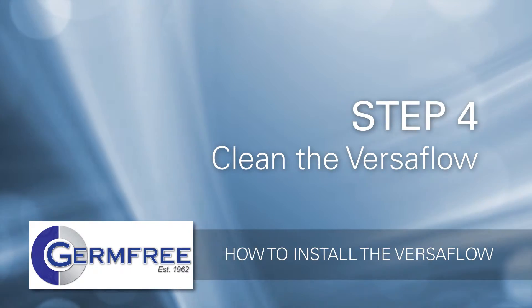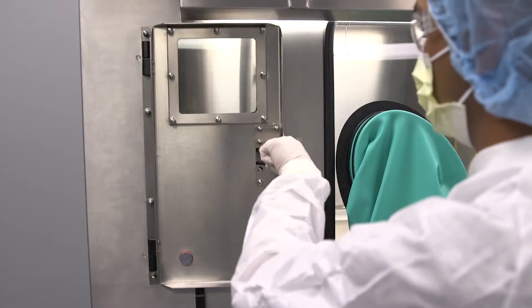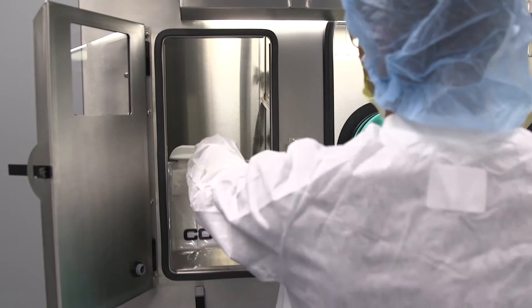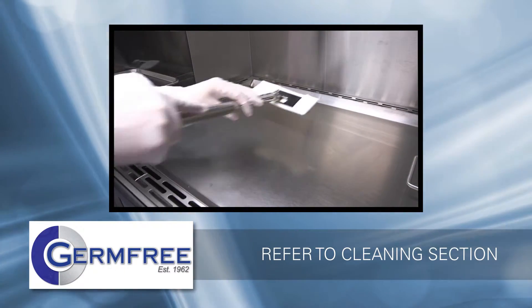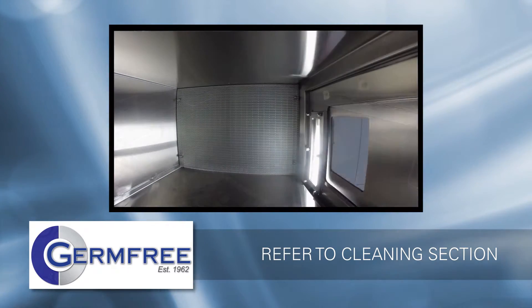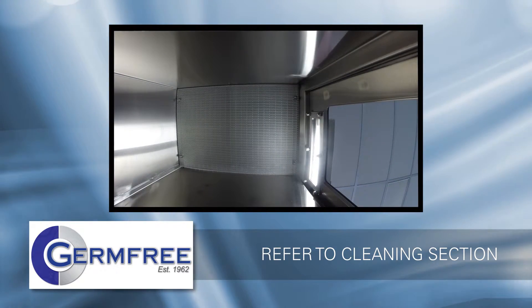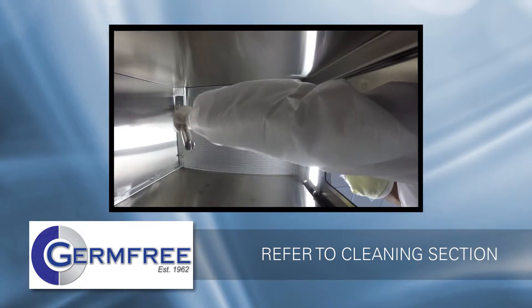Step 4: Clean the Versaflow. Before using the Versaflow for making patient preparations, the entire unit must be thoroughly cleaned. The cleaning section of this video will walk you through the steps required for both the initial and periodic rigorous cleanings as well as the frequent between-use cleanings. Once your Versaflow has been properly cleaned, you will be ready for the final step.